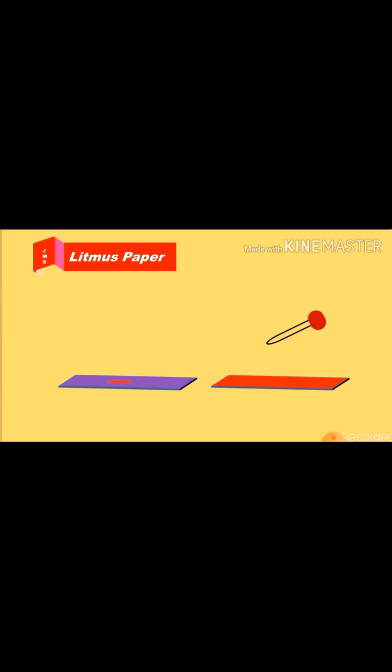Let's see how litmus paper is used as an indicator for acid or base. Litmus paper is available in the form of strips — blue strip and red strip. Pour some drops of acid on the blue litmus. We observe that in the presence of acid, the blue strip changes into red. Pour some drops of base on the red strip; we will observe the red strip will change into blue. In this way, litmus paper can be used as an indicator.